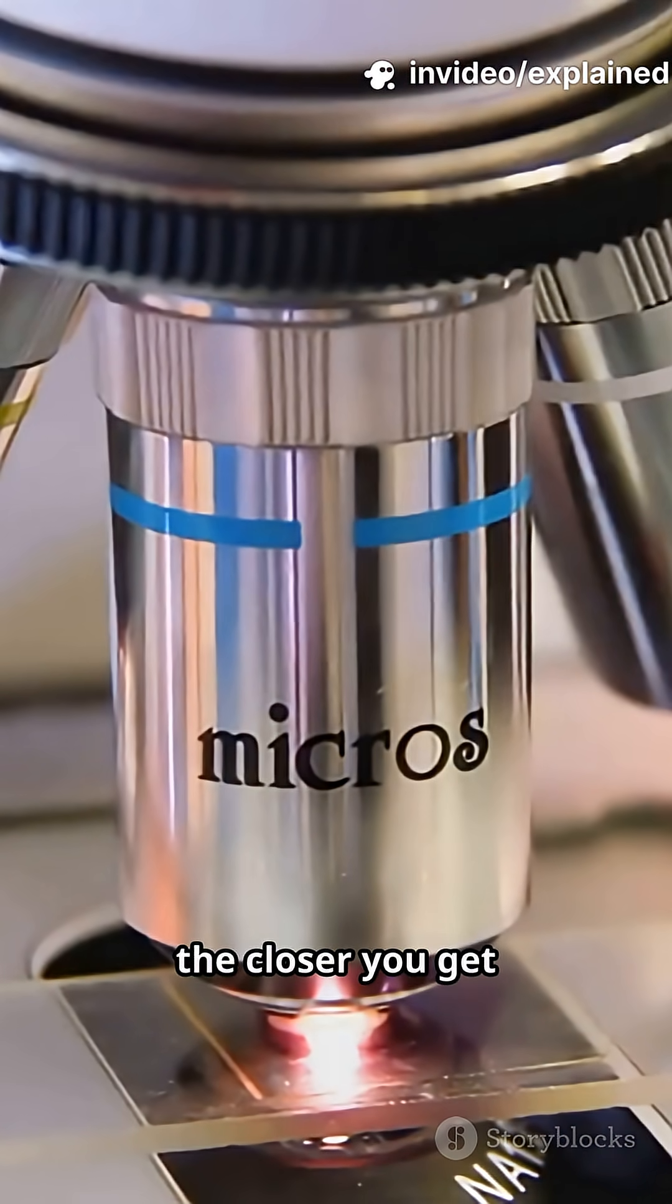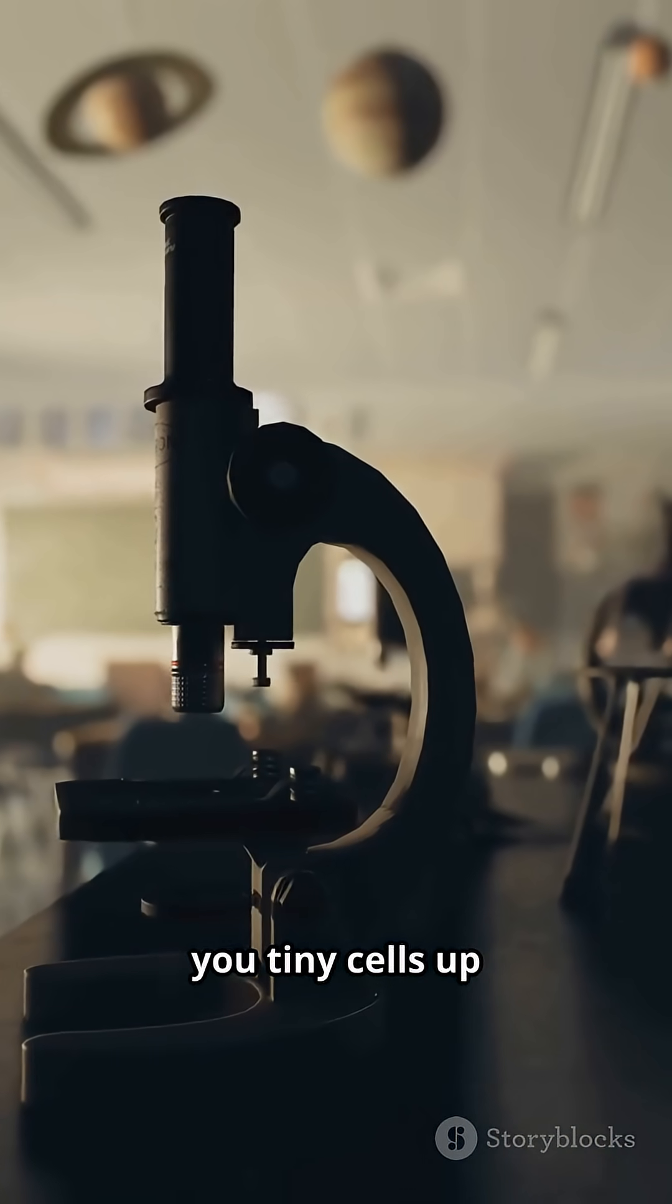The more powerful the lens, the closer you get to the action. Simple light microscopes can show you tiny cells up close.